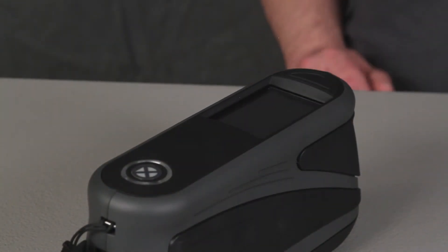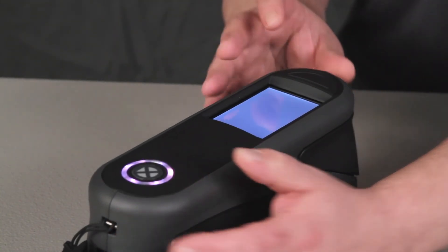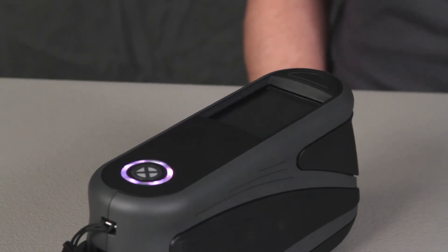To turn your instrument on, simply push the button on top. You will hear the shutter and the device will calibrate. We also recommend calibrating your device to the instrument's reference calibration tile before first use. Refer to the video on calibrating your device.